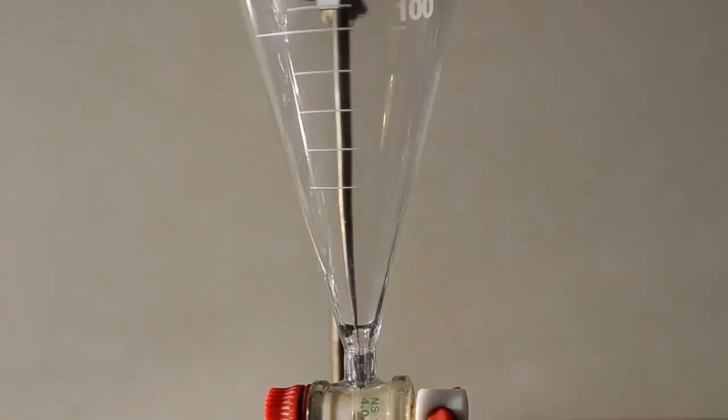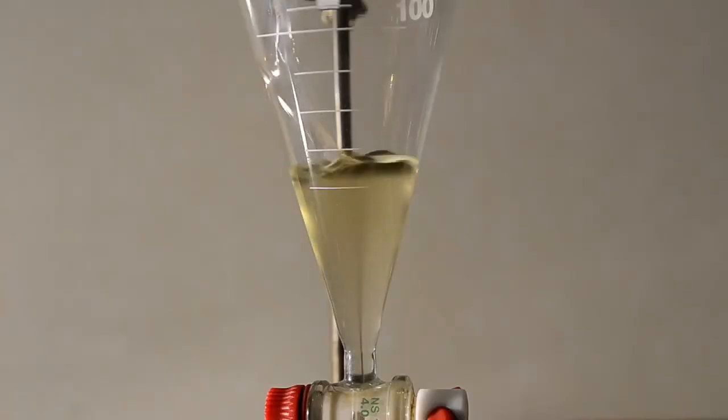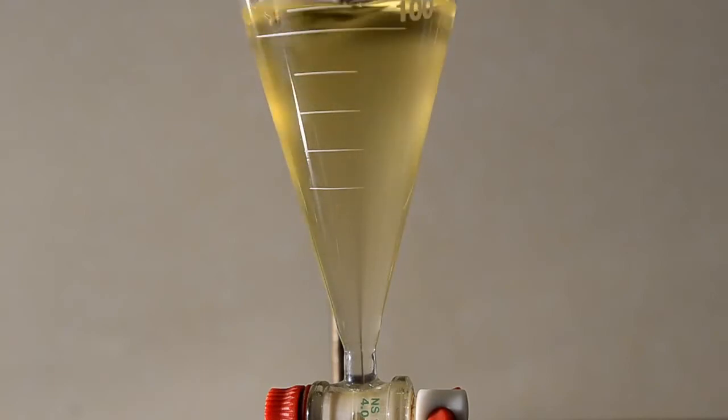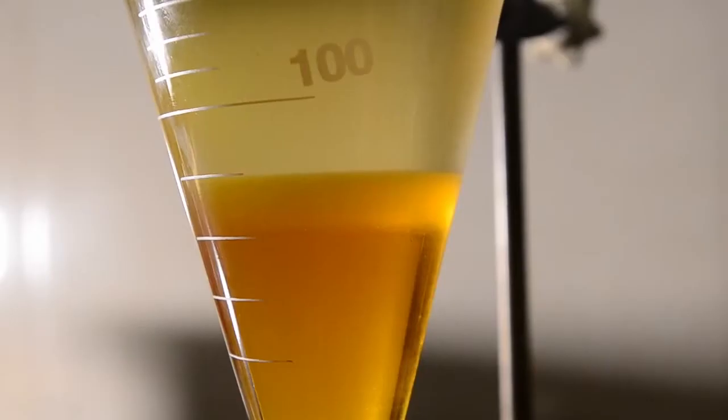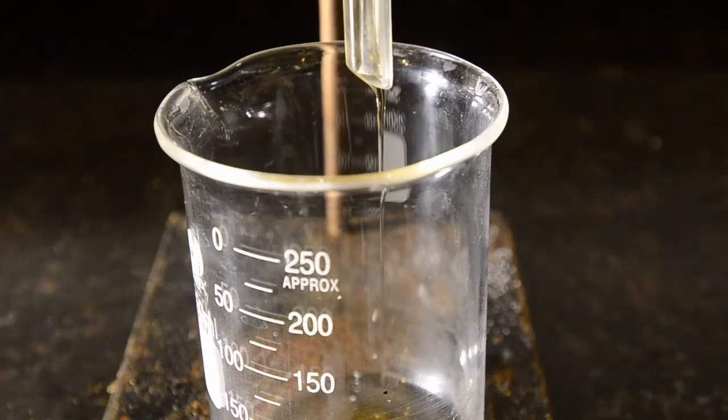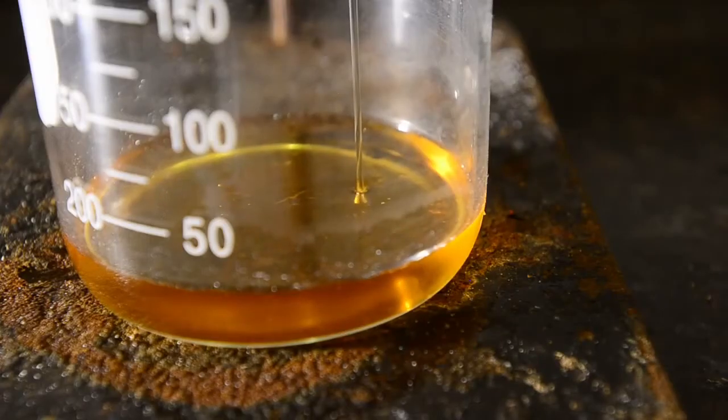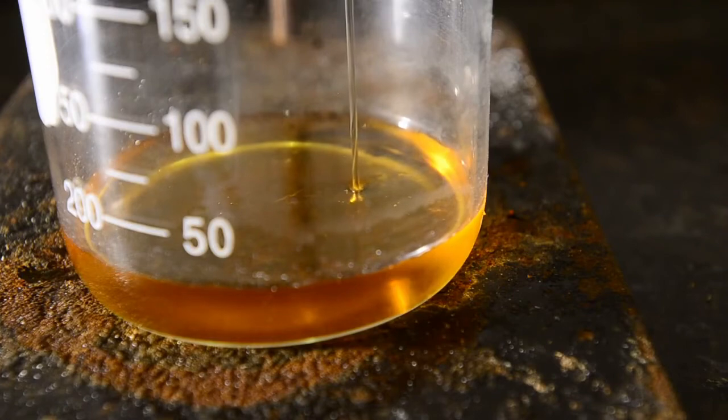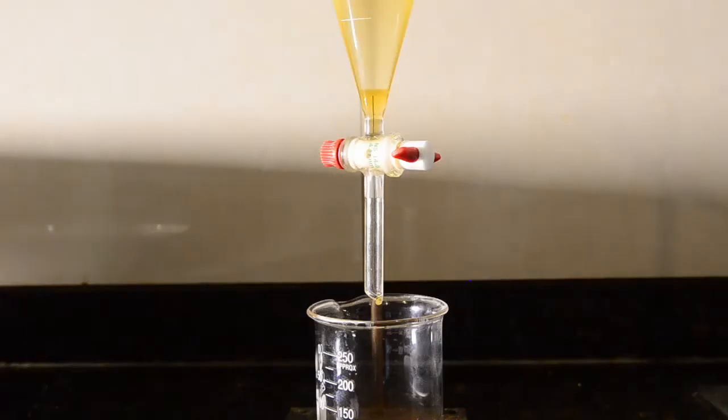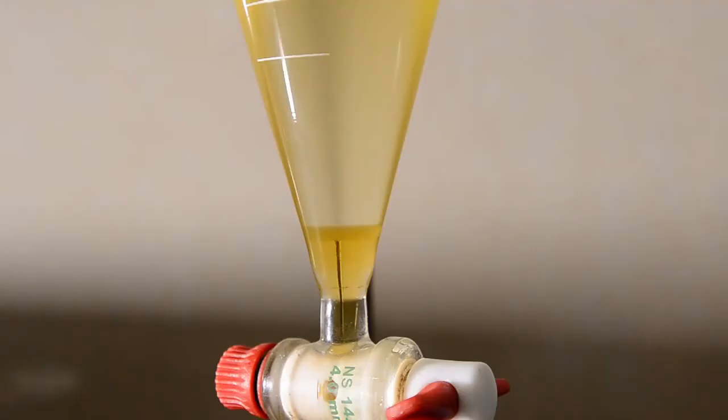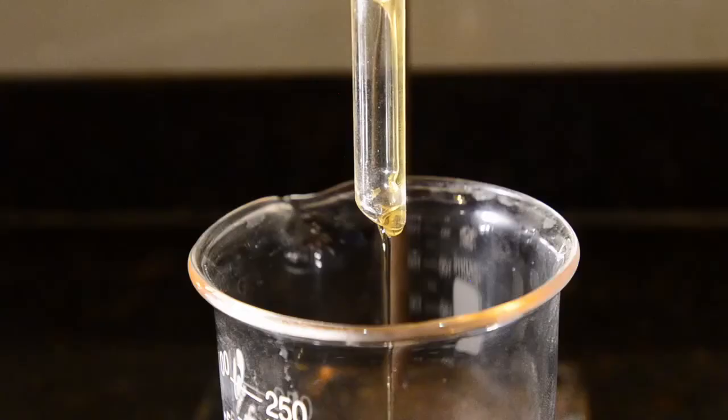Pour the mixture into a separating funnel. It just fits the 500 ml funnel. Allow the bottom layer of glycerol to separate completely. Then remove it into a beaker. It's pretty viscous and you'll find that if you leave the ester layer for a while some more will drop out of suspension in the funnel. Allow to separate as much as you can, and then drain off the last bit of glycerin.